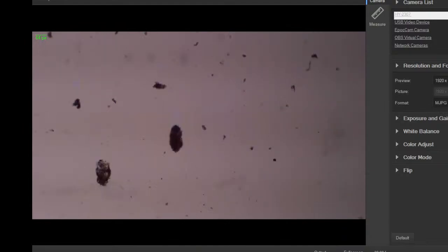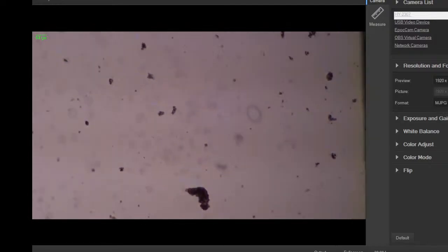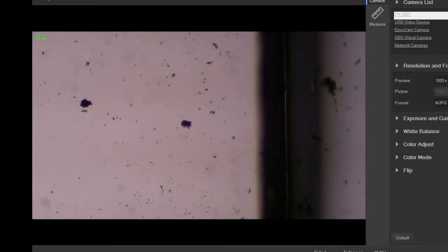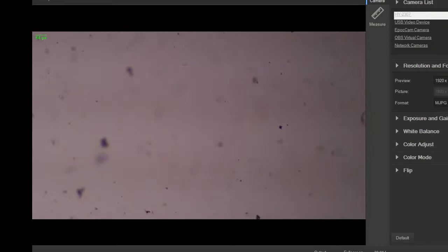Okay. Hunt, hunt, hunt. What do we got? Some little random bits. Some air bubbles.